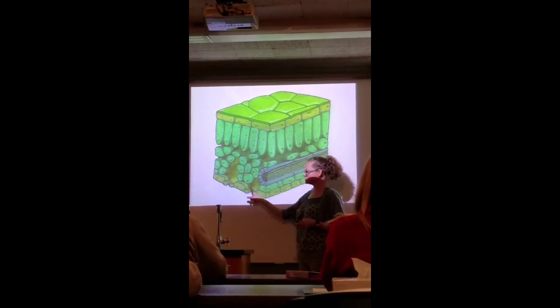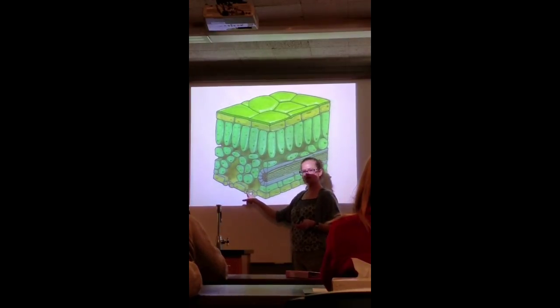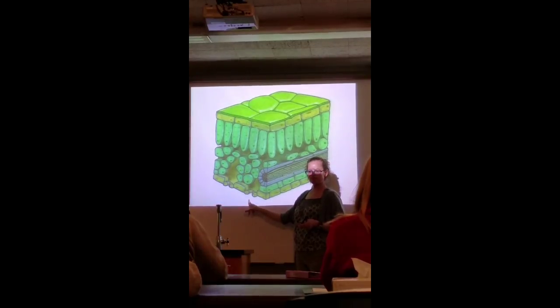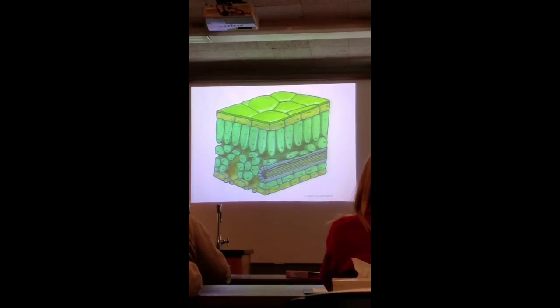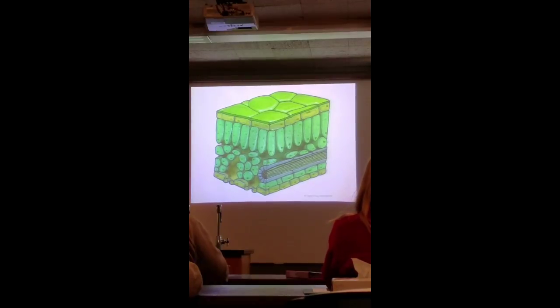And in this whole structure, we have the stomata, these guard cells, and then the gap in between is called the stoma. If you know anybody who's ever had a tracheotomy, they have a hole that's called a stoma. Same verbiage. And the function for those is gas exchange.